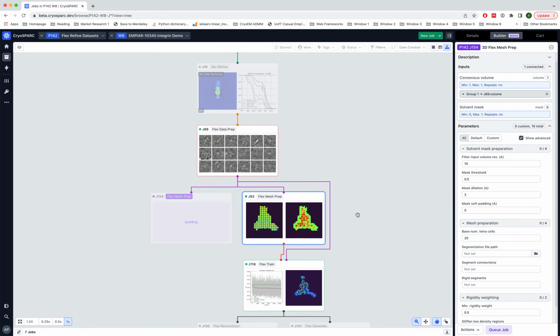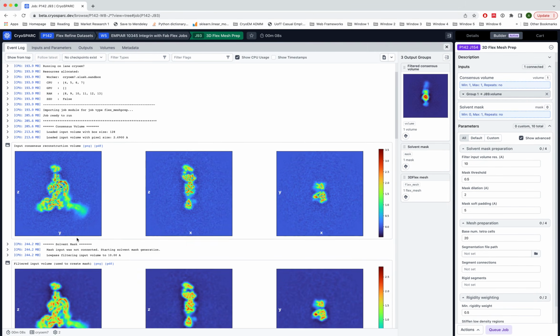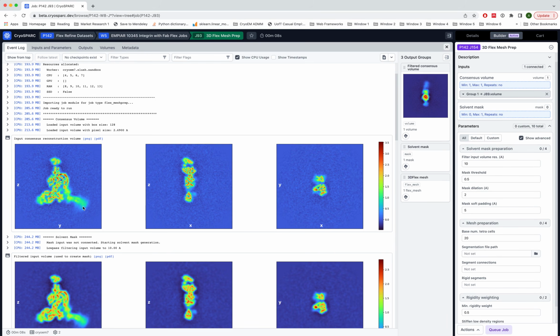said, all of the regions in the canonical density where you expect to resolve structure or improve the structure that's already resolved. So you want to be careful that your solvent mask doesn't accidentally cut off flexible regions of the particle. For example, in this case with the integrin, this flexible arm has relatively low density and obviously poorly resolved density compared to the rest of the structure. And so we don't accidentally want to cut off this flexible arm in preparing the solvent mask.